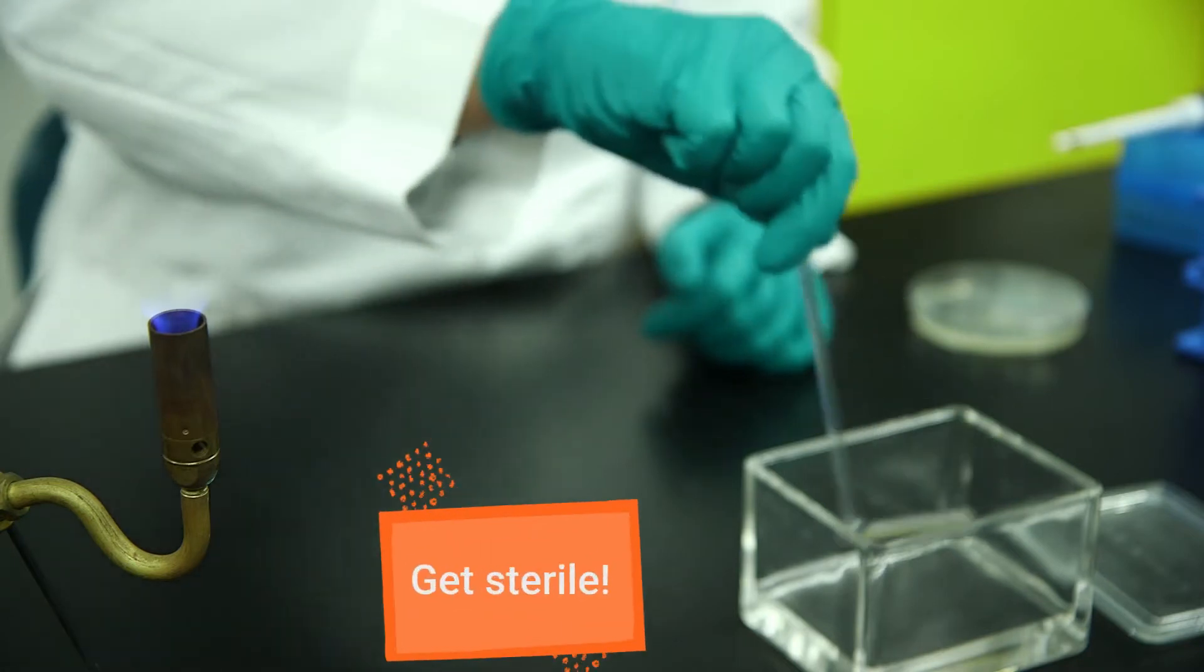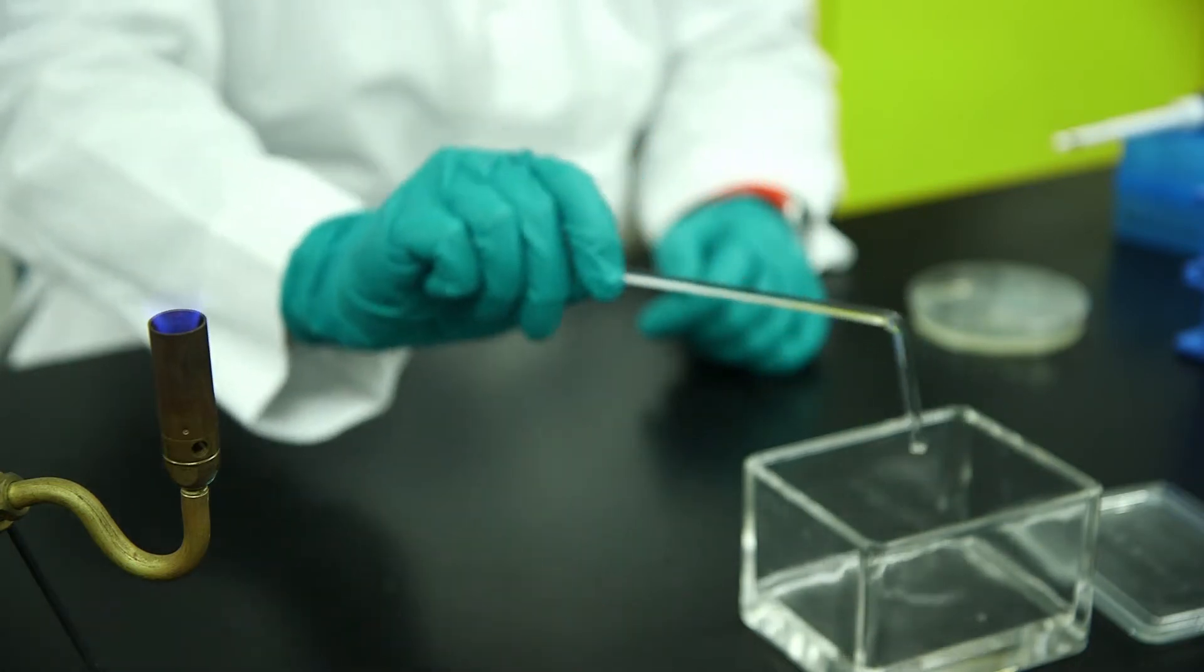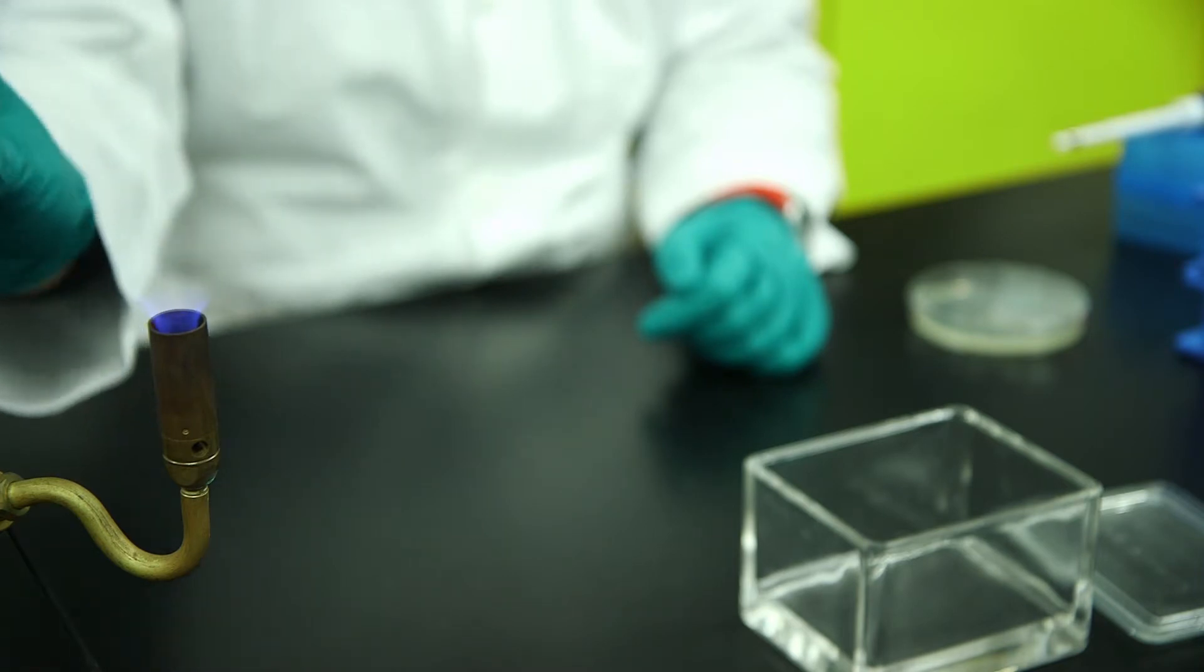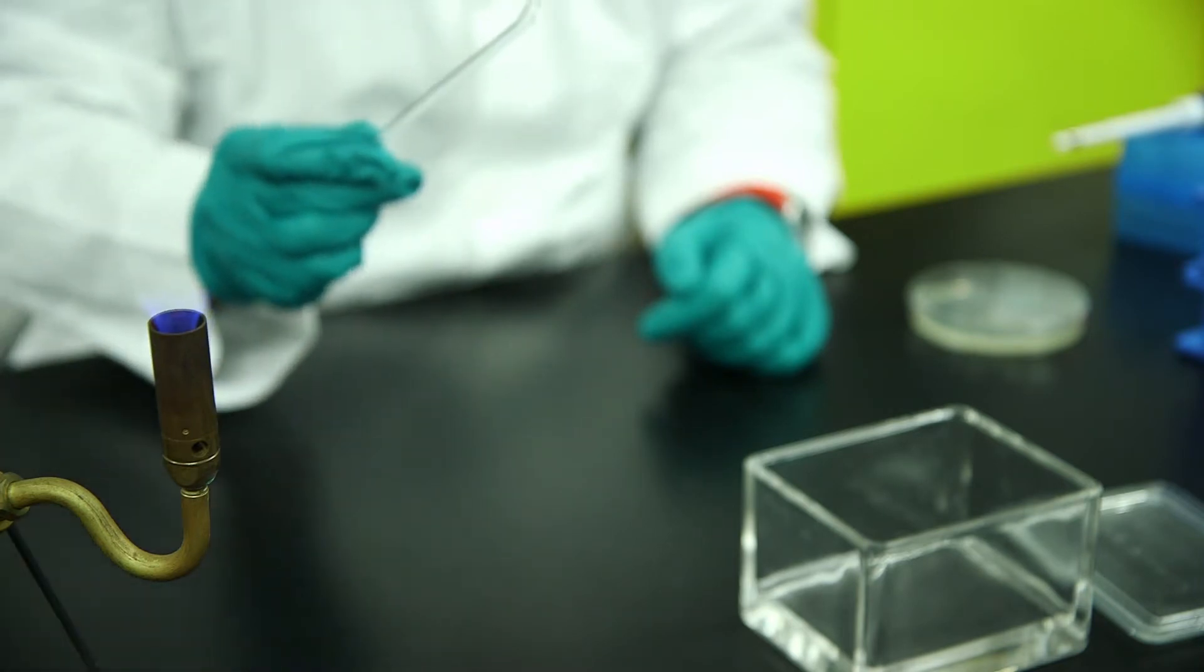Now, sterilize your spreader bar by dunking it in ethanol and then holding it above the flame. A quick second will be enough. The alcohol and heat should kill anything on the bar.